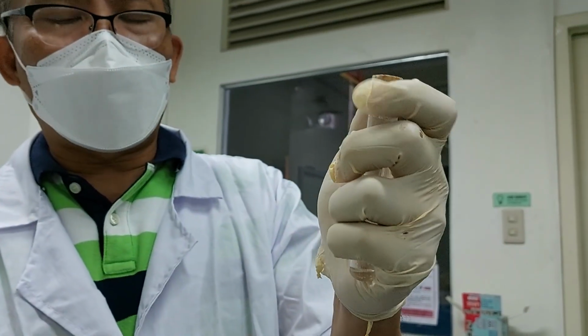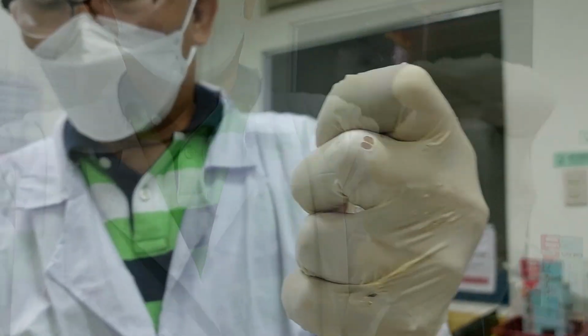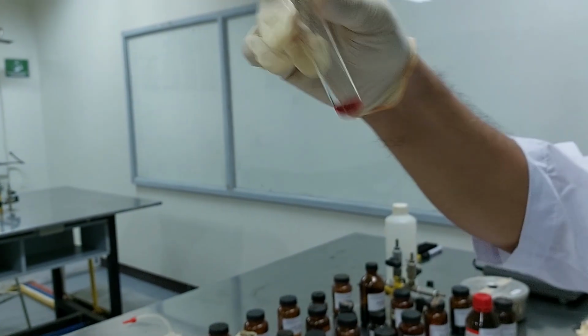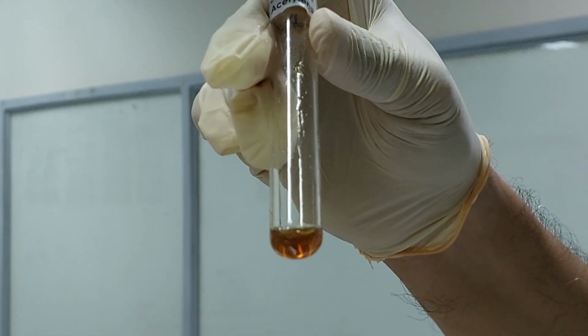I have to place the KMnO4 right away because the acetylene might escape, no? Okay, so let's see if our experiment is successful. Potassium permanganate is purple. And see if there is a change in color, okay? So you see that change in color.